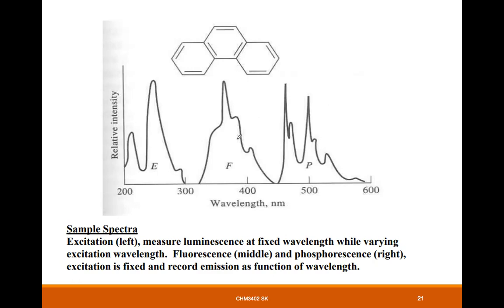Yeah, so you can see there should be a significant difference in terms of wavelength of the UV region and the fluorescence wavelength, as well as phosphorescence.